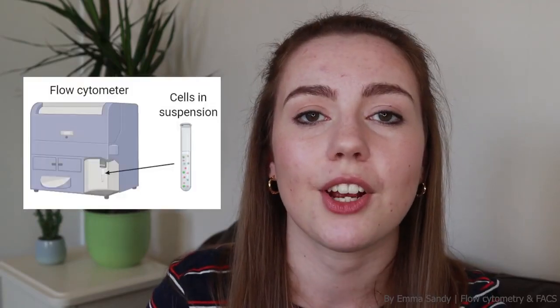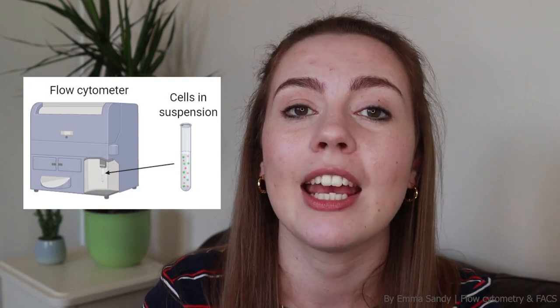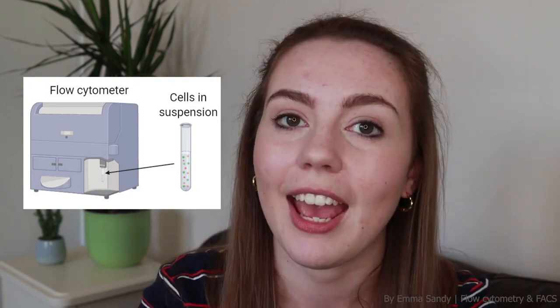Flow cytometry is a way that biologists are able to analyse and count cells. It's super handy for immunologists to be able to study immune cells, but it can be used to study a lot of things such as the cell cycle, maybe cancer cells, bacterial cells, or even microscopic parasites. So flow cytometers are the machines that do the work. They take a sample of cells that are in suspension and this flows through the machine, hence the name.